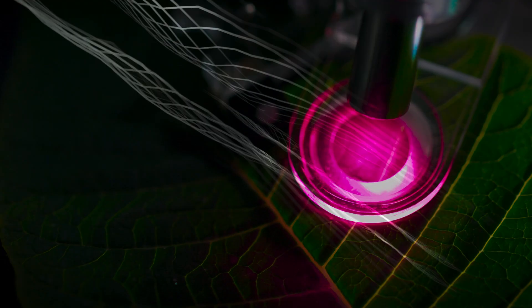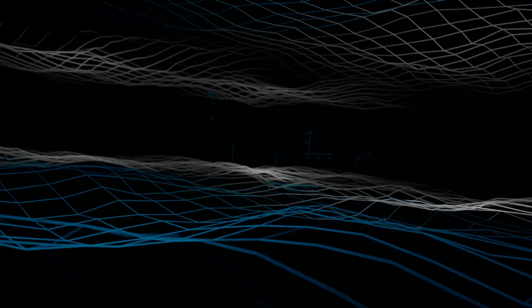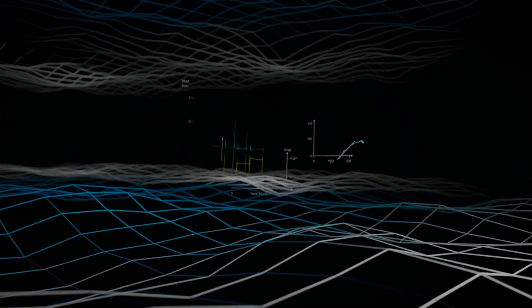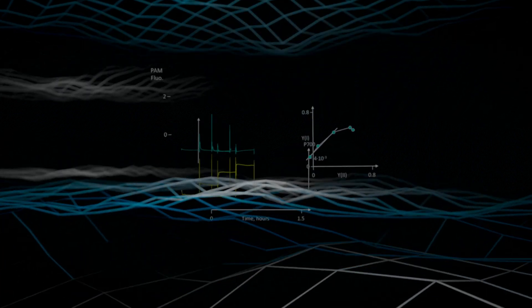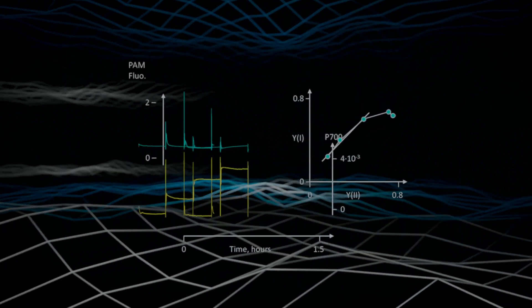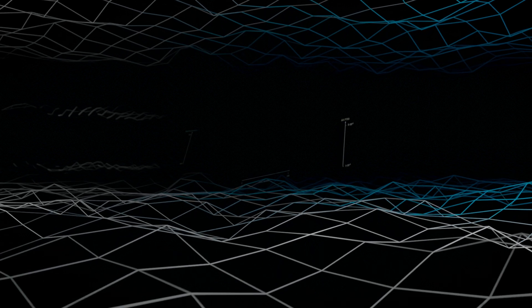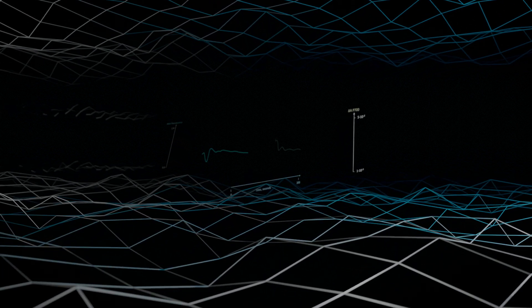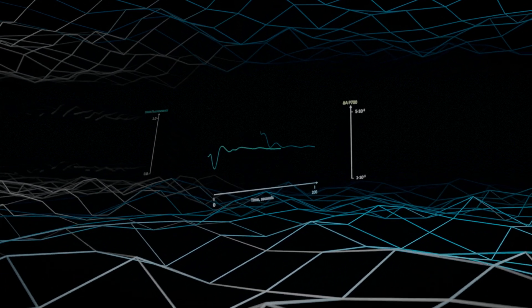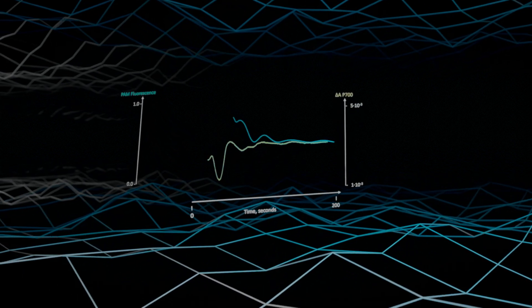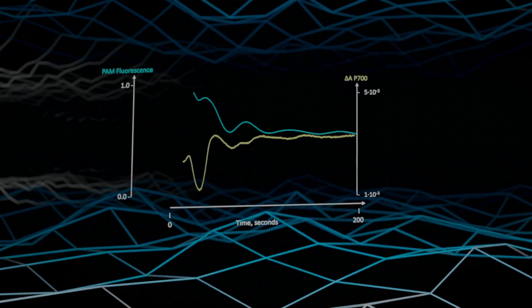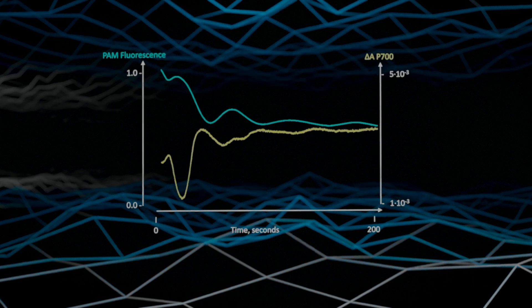The present experiment studies the two photosystems at increasing light intensities. The signal variations induced by saturating light pulses provide key information about the performance of the photosystems. Automatic evaluation by the software demonstrates that the photosystems act in a coordinated manner at higher light intensities.